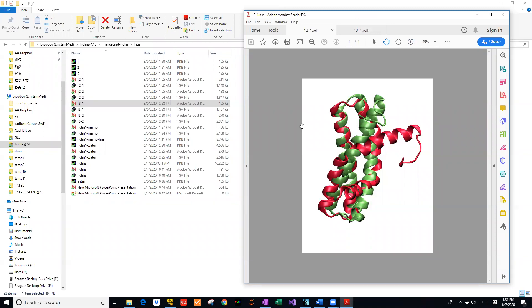Today we are going to use VMD to align two proteins. We have two proteins here: the green protein structure is the structure predicted by the i-TASSER online server, and the red protein is a protein from a simulation of this protein in water. We are going to compare the difference between these two structures, and for the comparison we need to align the two proteins together.